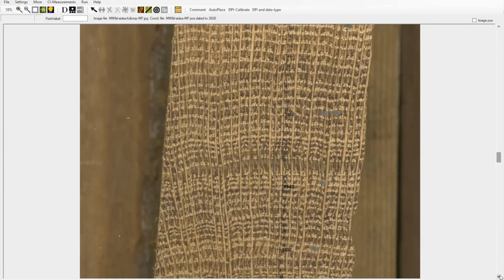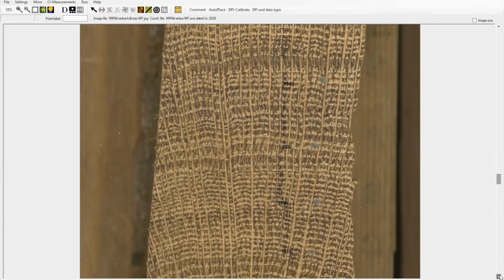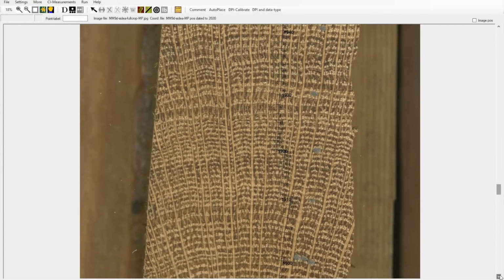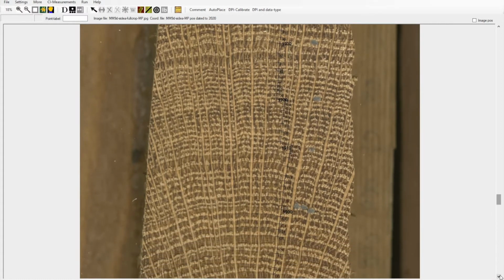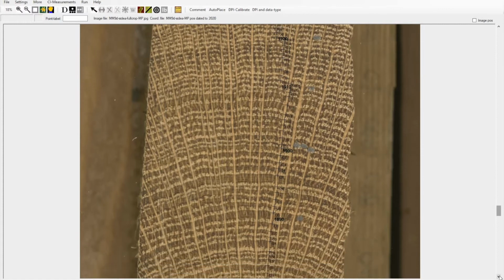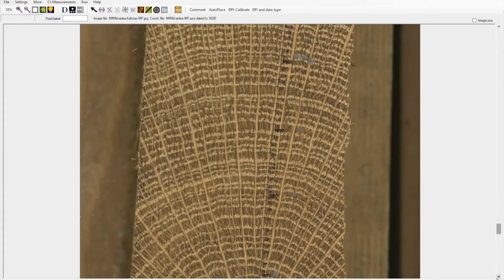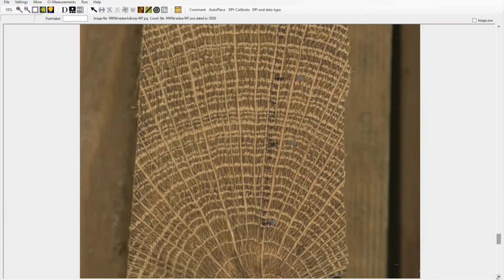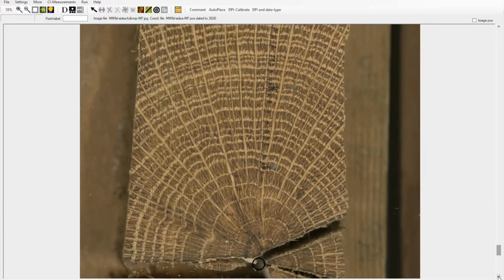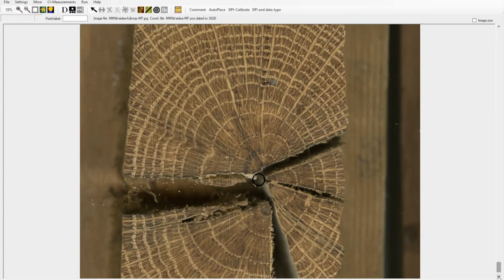In order to measure the ring widths, dendrochronologists use computer software such as CooRecorder, which uses an image file of the scan and provides selection tools to mark ring boundaries and measure a sample. Points selected in CooRecorder are recorded as coordinates, and the software calculates the distance from one coordinate to the next in millimeters or indices. The sample you see is from our Monmouth research and it is fully measured. So now I'm going to demonstrate how we can measure a sample in CooRecorder.